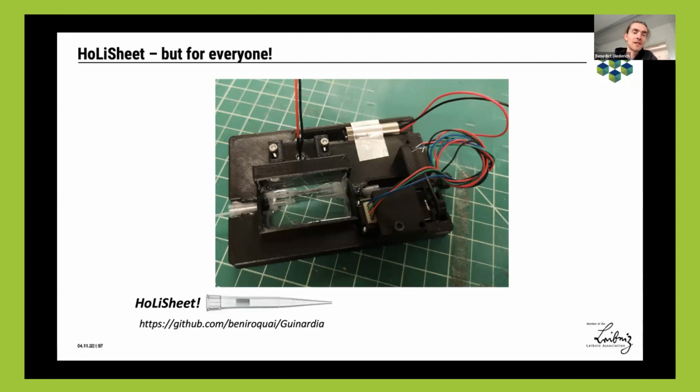And with this, you were then able, in combination with the small motor and the FEP tube, to create this little device which did exactly the same, but on a standard microscope. So we did the rapid prototyping in our system, and then once we were done, we just translated that into this little device, which now can be used by anyone. It's also open source and documented in GitHub. And then, yeah, this is a really nice case of how to use this thing.